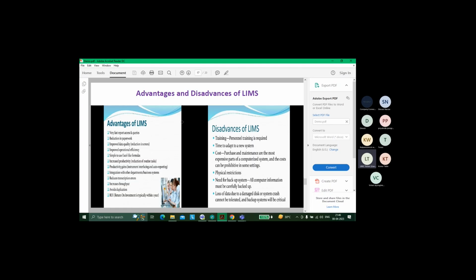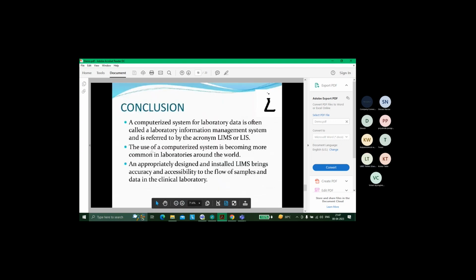They have a specific lifespan as well. And maintaining racks and racks of paper, big shelves of paper, is a very big challenge. And if you try to change anything in LIMS intentionally, maybe with some wrong intentions, immediately you will get caught. There is no way you can do such things, so these are the advantages, right? So we need to think about it.